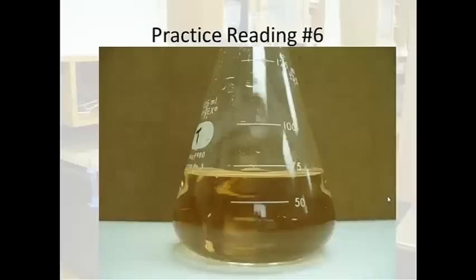Okay. Finally, reading this. This is an Erlenmeyer flask. Notice it's a little bit different reading an Erlenmeyer flask. The distance here is a measure of 25 milliliters. And the distance here is a distance of 25 milliliters. Notice those two distances are not the same. This probably isn't a very good tool if I want an exact measurement, both because the increments are in 25 milliliter increments, and also because I really can't tell very well what the distance is going to be for a precision measurement here. So if I wanted to get exactly 80 milliliters, this would not be the device I'm trying to get.